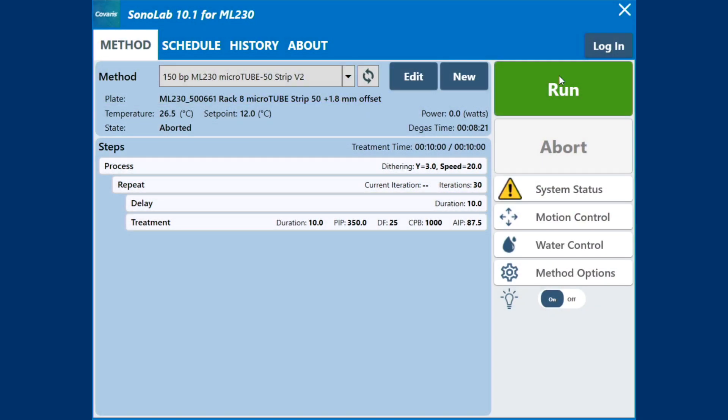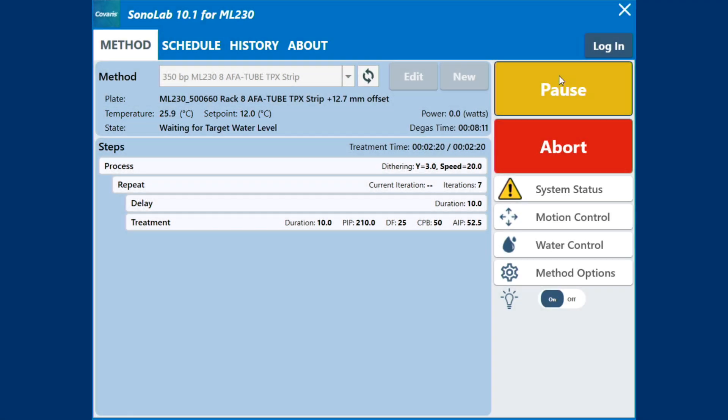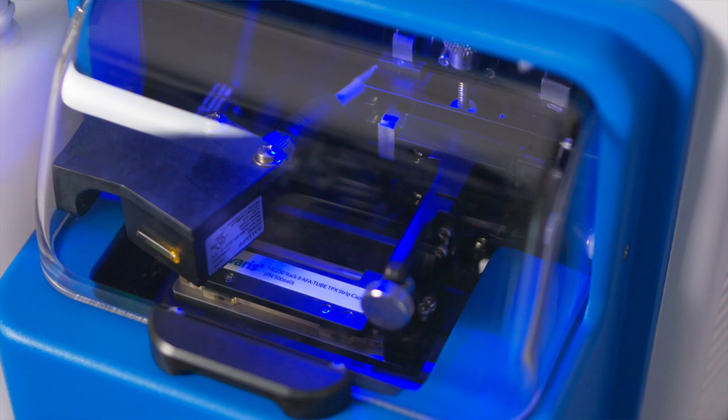The ML230 water control automatically fills the bath to the appropriate level for the tube specified in the method when the Run button is touched to start a method. The ML230 system automatically adjusts the water temperature to match the method temperature set point after Run is selected. The water temperature status will turn green when the temperature is within the min and max limits. The safety cover must be closed. The instrument will not run if the safety cover is not closed.